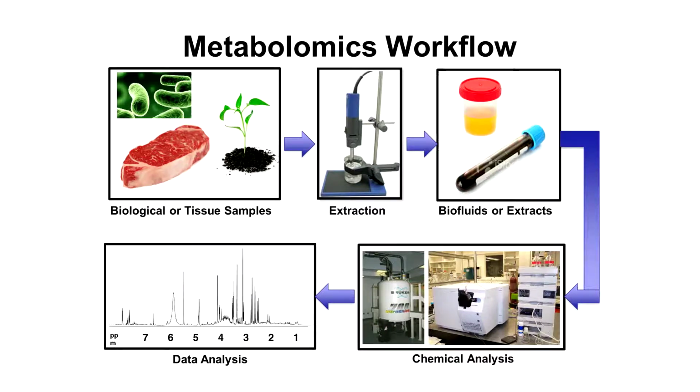And largely what we're doing in metabolomics is analytical chemistry. The analytical chemistry we do is basically based on liquid chromatography, gas chromatography, mass spectrometry, and NMR spectroscopy. So this route of starting with a sample, extracting, and going down to some analysis is something that's been going on for decades. So in that regard, there's nothing new to metabolomics. On the other hand, the central advance that has allowed metabolomics to happen is in this last step.